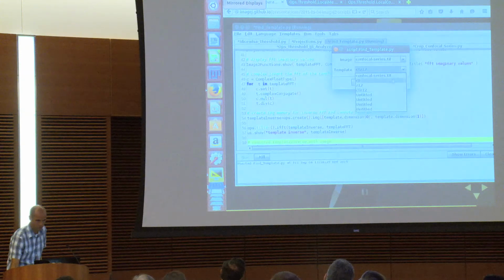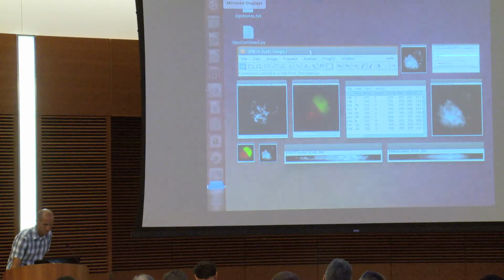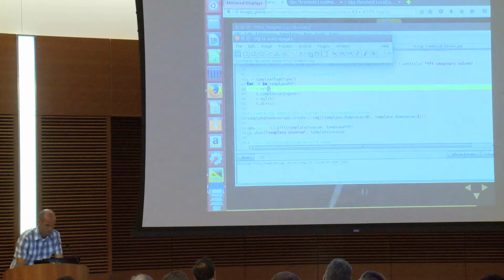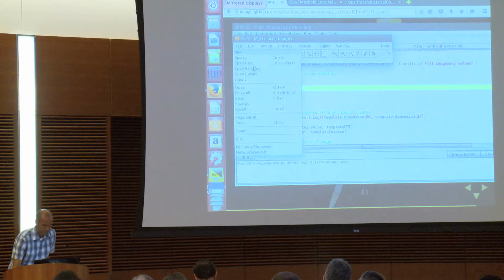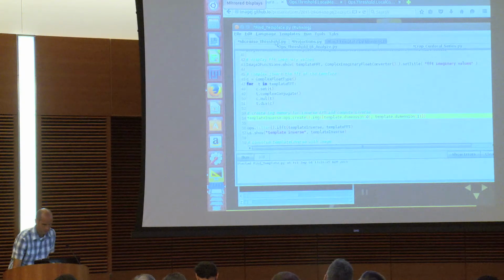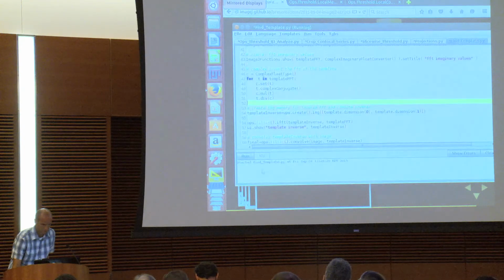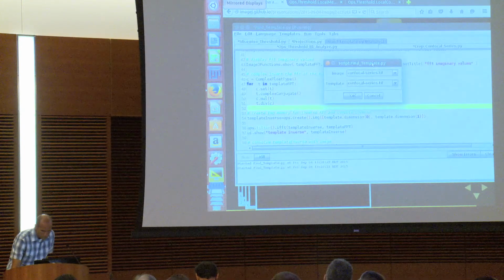Okay, I actually don't see the title is wrong. I'm not sure if I. You close down your extraneous images. Just very quickly see if I can. Here they are. Maybe I just lost it somehow.